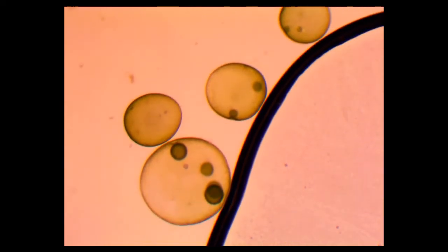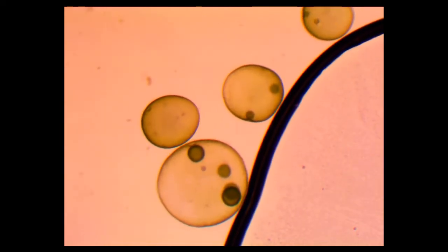Here we can see the volvox using the 4x objective for a 40x magnification. Here I've moved it up to the 10x objective. We can see some daughter colonies, and you can see some of the smaller ones moving around.